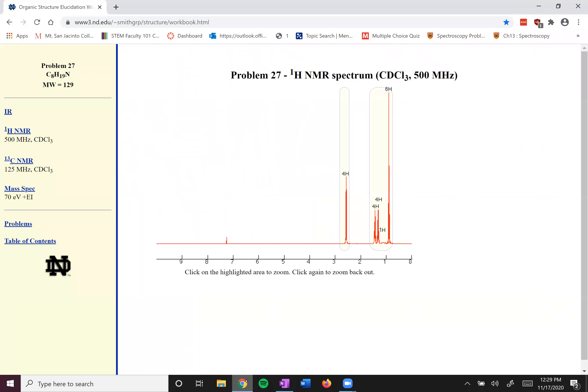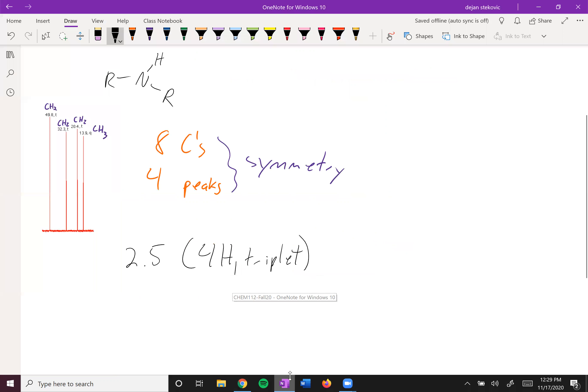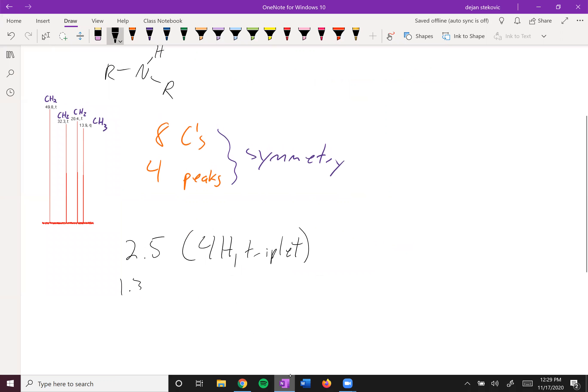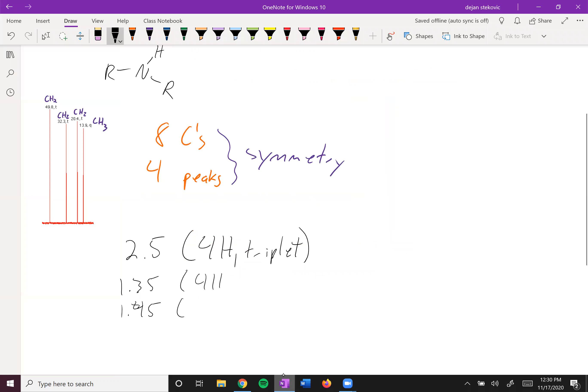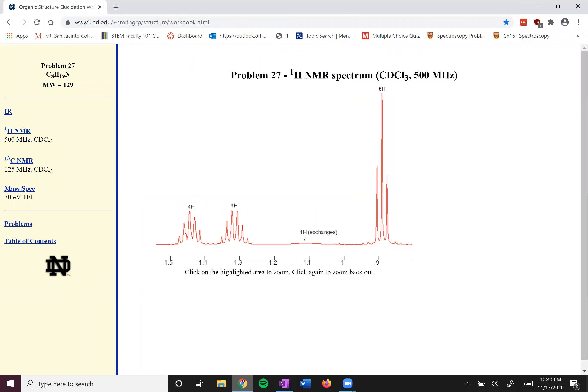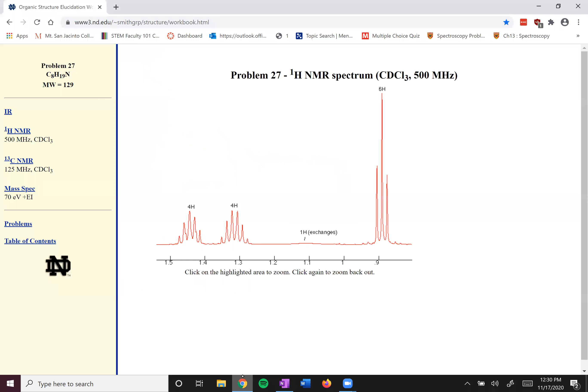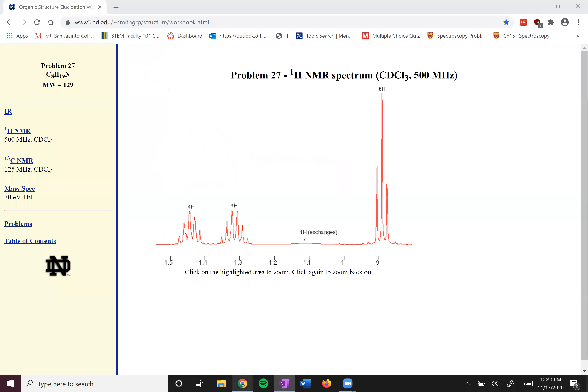And then we can zoom out. And then we'll zoom into this other peak. And so we can see we've got two 4H multiplets around 1.3 and like 1.45. Let's go 1.35, 1.45. They're both 4Hs. And they're either both multiplets or you can try to count. 1, 2, 3, 4, 5, 6. One is a sextet. The lower one, this is a sextet. And then the other one, 1, 2, 3, 4, 5 is a pentet. Or you can just call them multiplets as well.